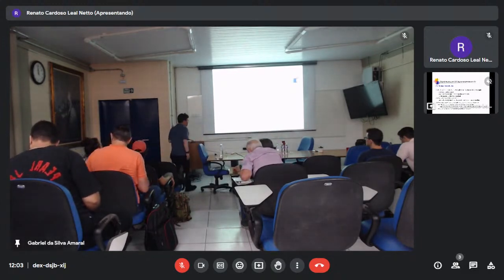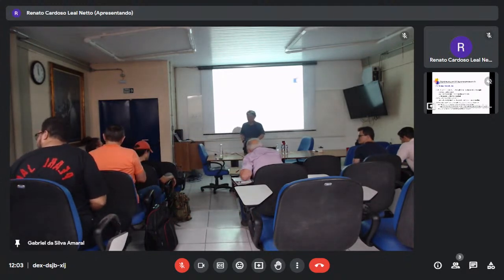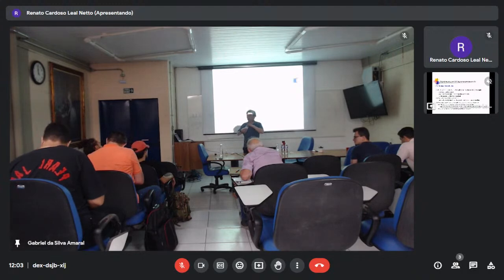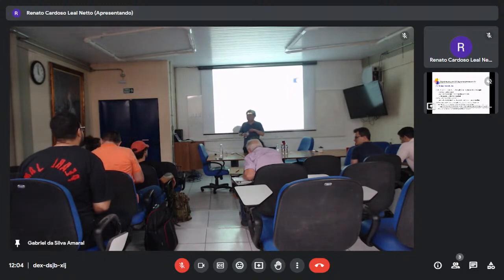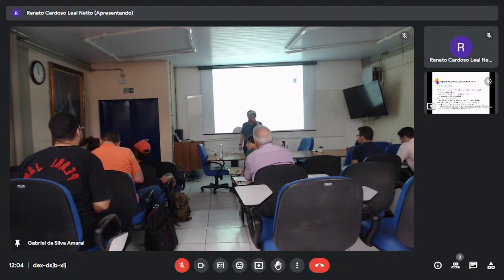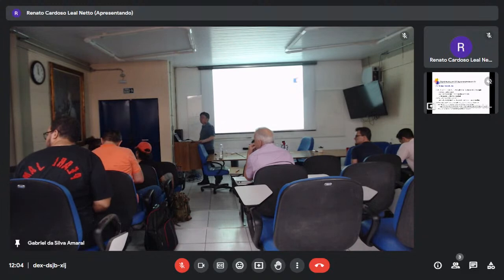Any question? Sure. Are you going to talk about how to concatenate the signal from the NMR to the mass spectrometry and try to create a more useful matrix, like they do in Glasgow? I have some doubts on this.